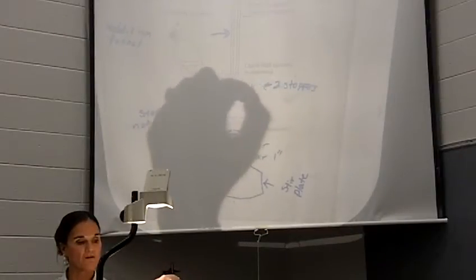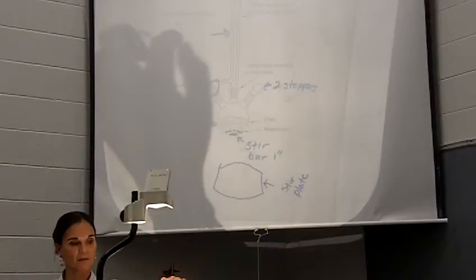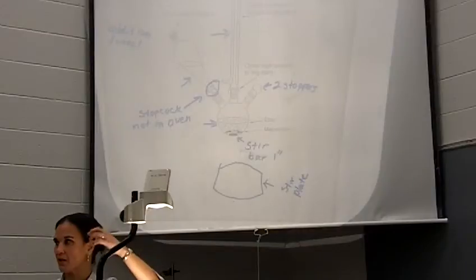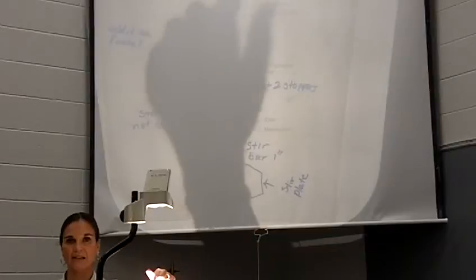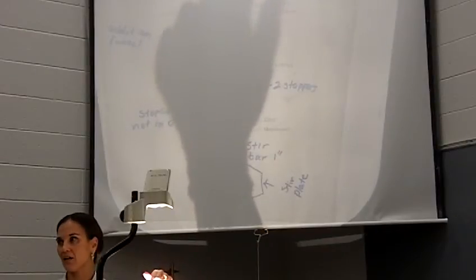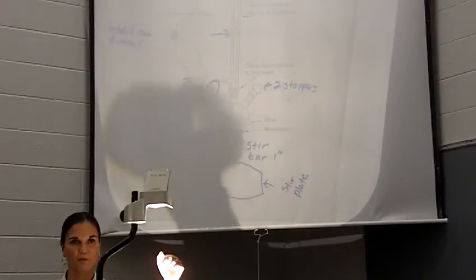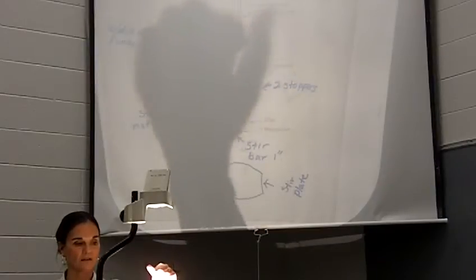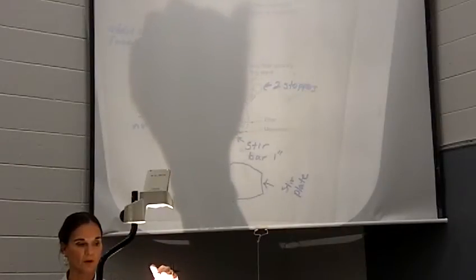Then you're going to have one of your stoppers on one neck of the flask, and then this is where we're going to stick our cotton, in the top of our separatory funnel and the top of our condenser. All right. This is how your apparatus isn't a closed system, so don't pack it in so tight that you make a closed system. Just put a piece of cotton in each that'll fit appropriately, so it won't fall in and will stay at the top there, but you don't want it in so tight you've closed off the circulation of your system.